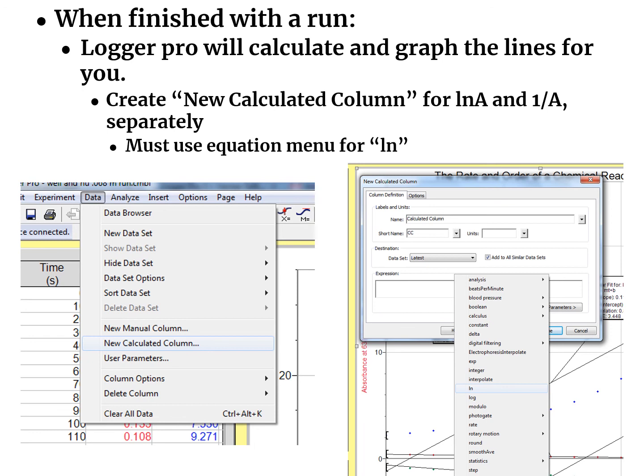You do the new calculated column, and then in the formula section, you put 1 divided by your absorbance value from the column that already exists, and just make sure that you have that value calculated for the rest of your data.